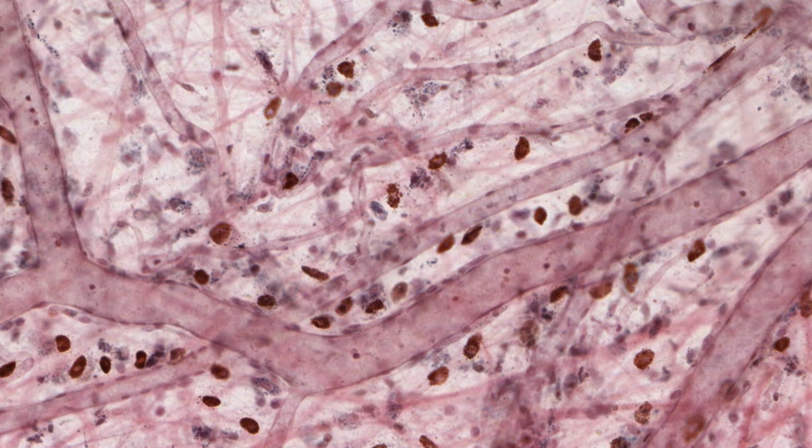The remaining cell types that you may encounter will be invaders from the bloodstream, particularly lymphocytes and eosinophils, and these will be described in later lectures.